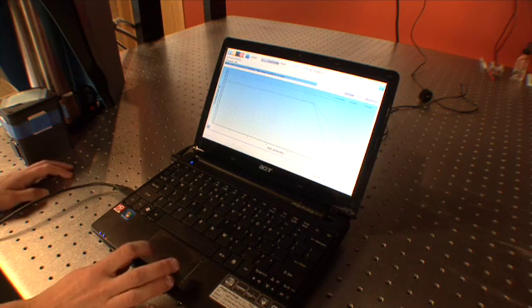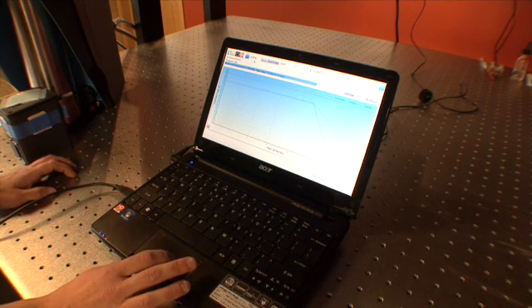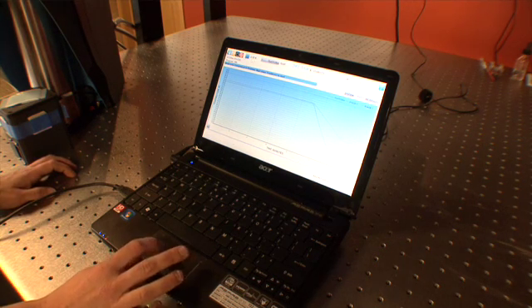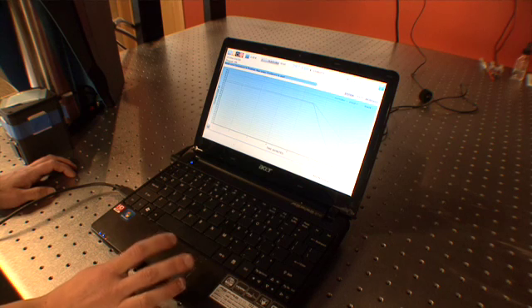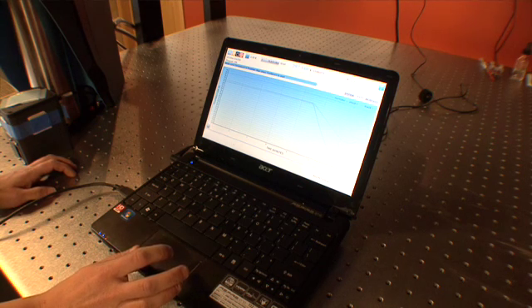I'll meet you at the point where you set your target temperature, the software's running, and you're ready to cool down. Once you've set the target temperature to 4 Kelvin, you're ready to cool down. Simply push the cool down button.